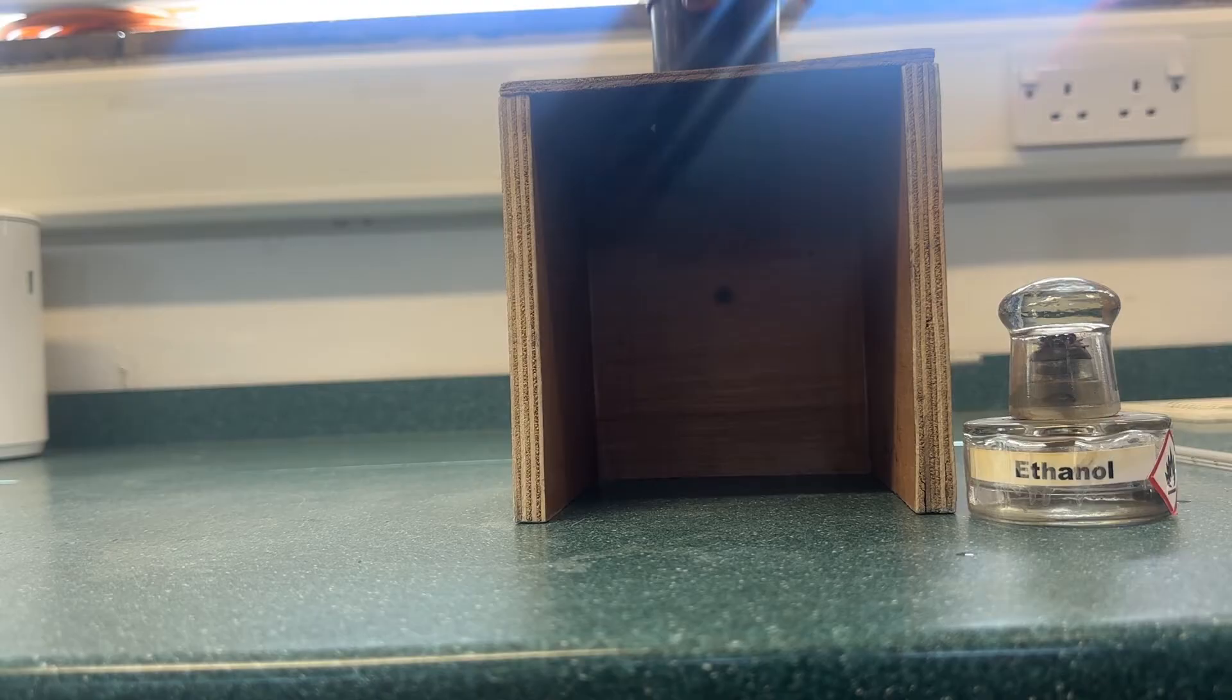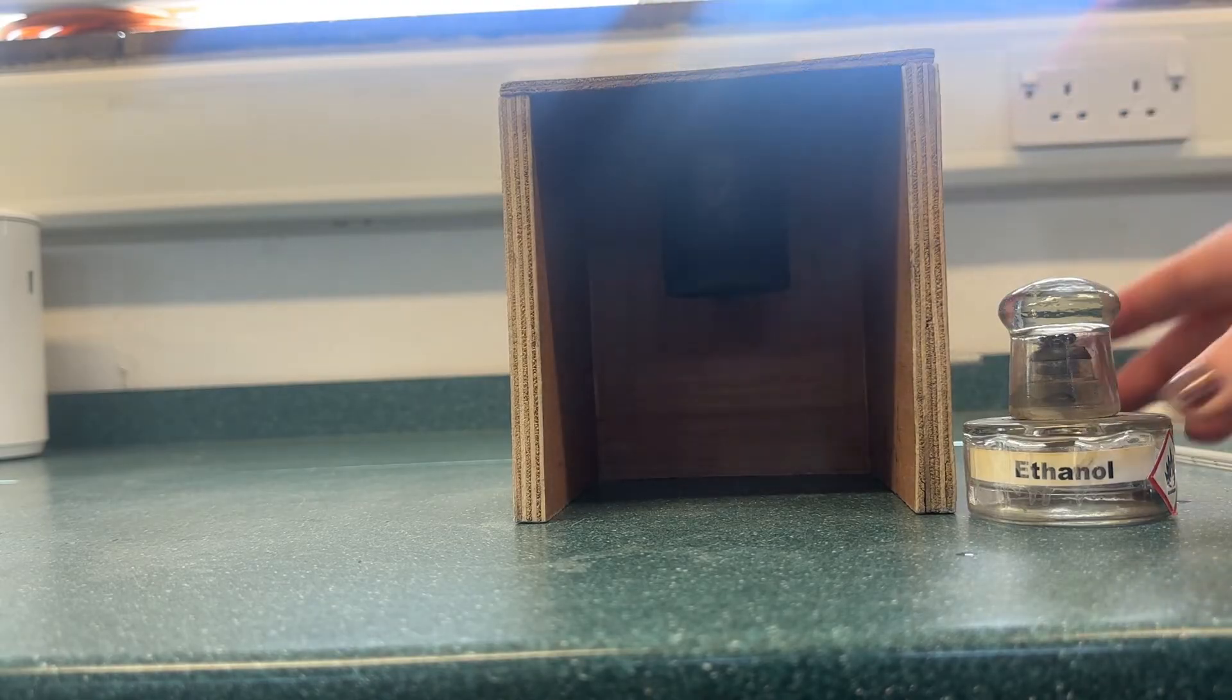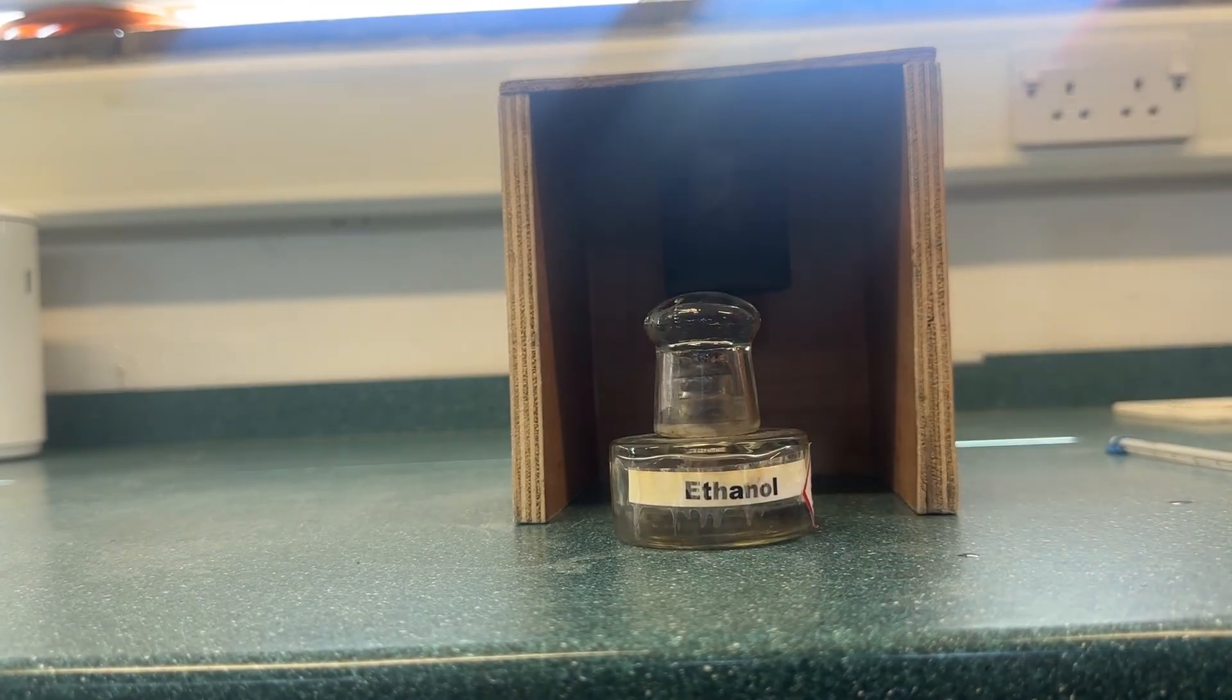Place the beaker back into the draft shield. The draft shield has three sides. This is to prevent heat escaping.